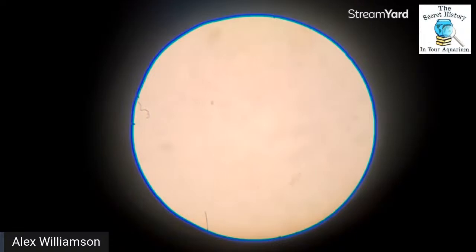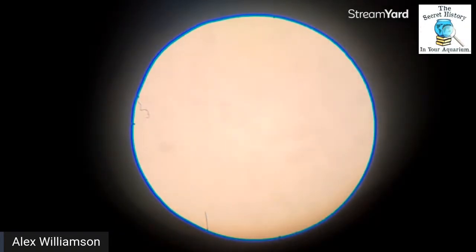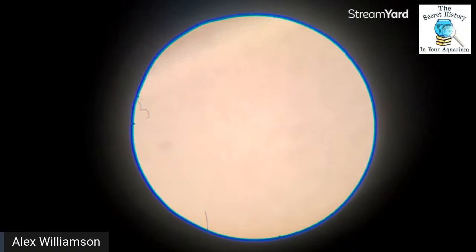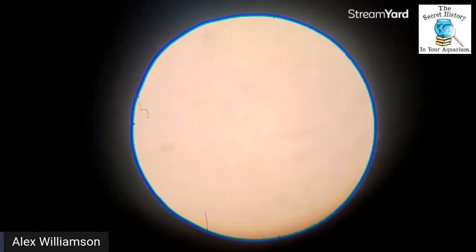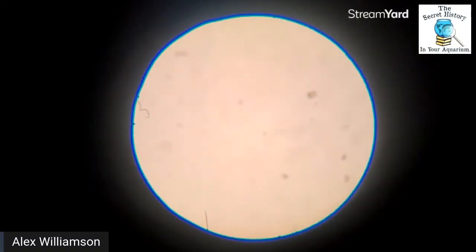So we're going to zoom in different levels of this and we're going to go straight to 100 times zoom. Or magnification, I guess, is probably what I should say. And it'll take a sec to dial it in because it's clear water, as I said. So we'll have to find a moving critter to zoom in. Oh, or the edge of the puddle sometimes works. Hold on. All right. And I haven't used any contrast dye yet. We might try some of that.